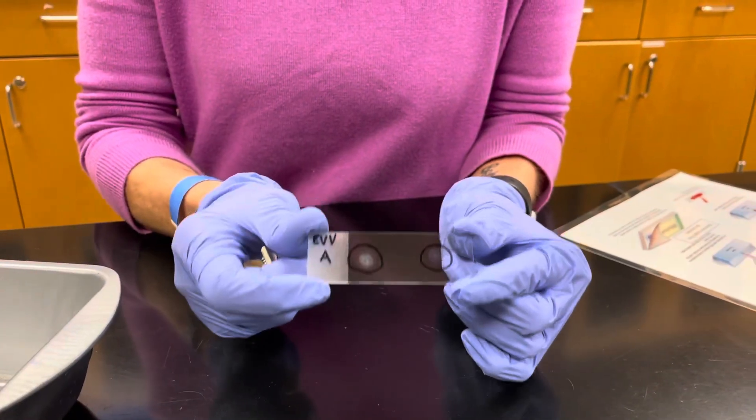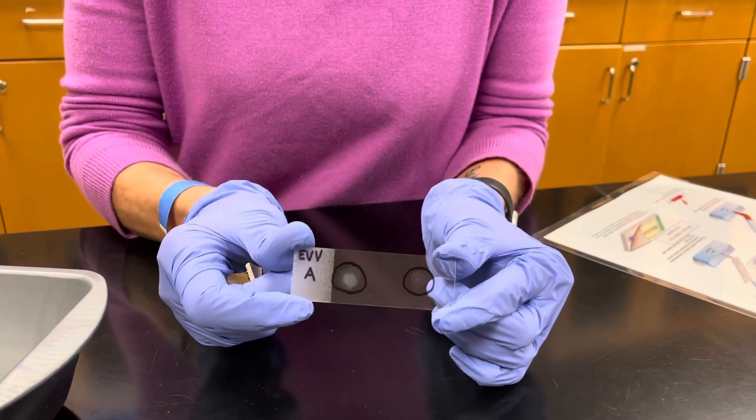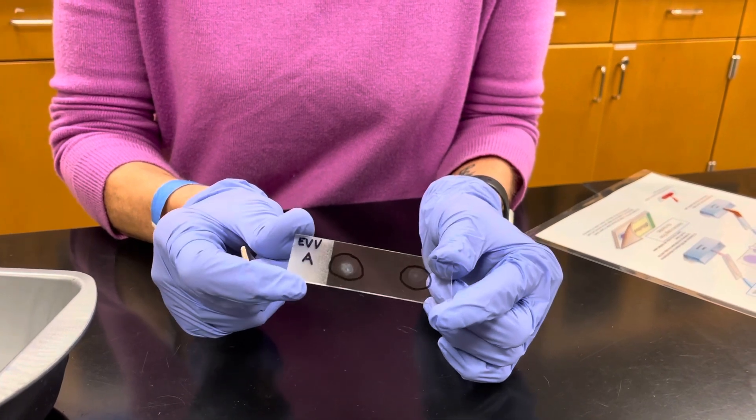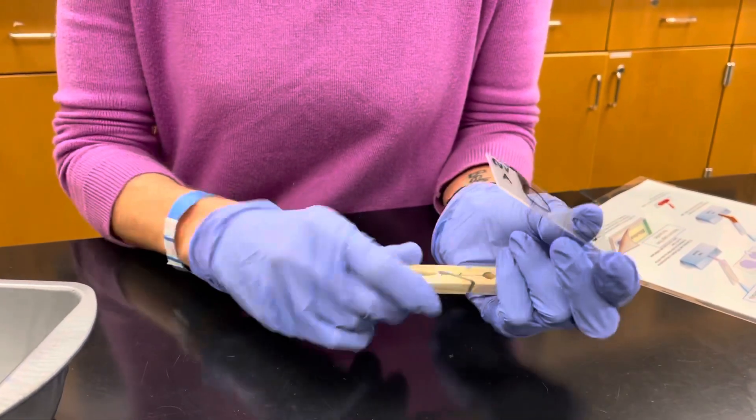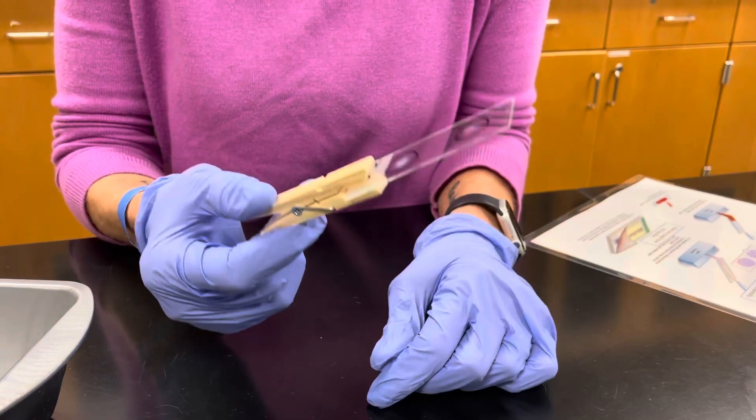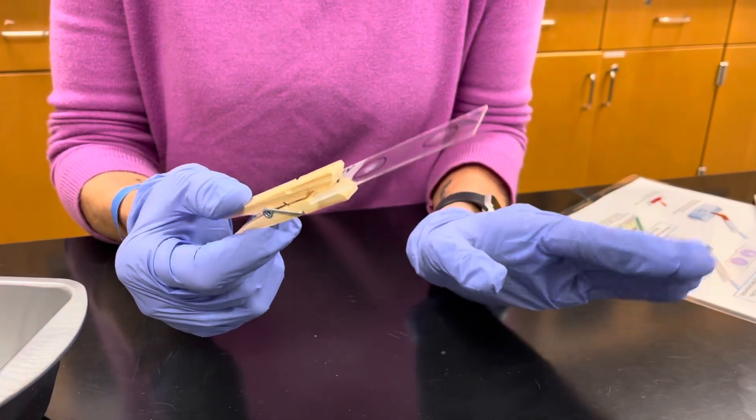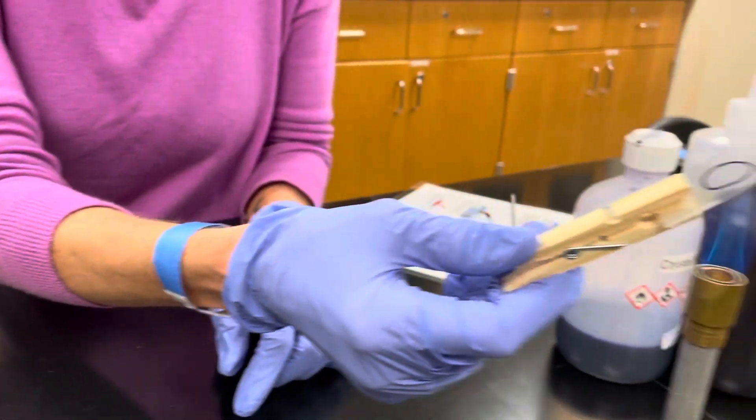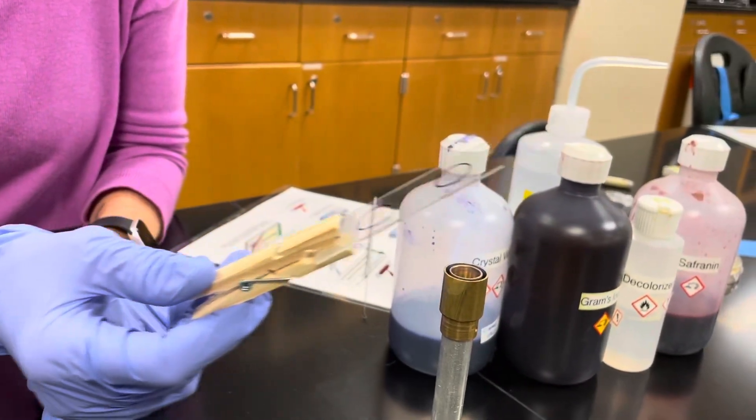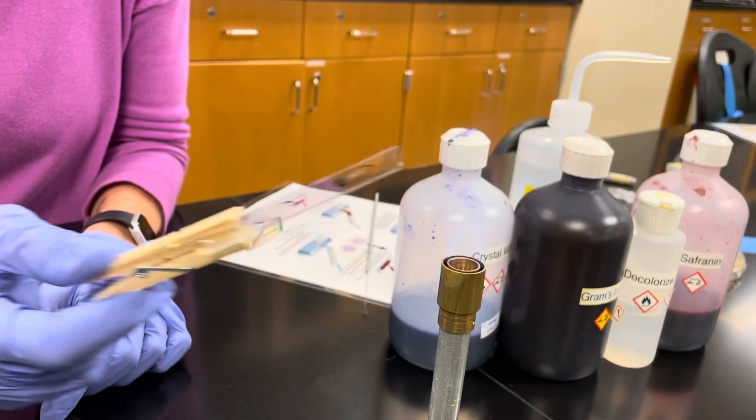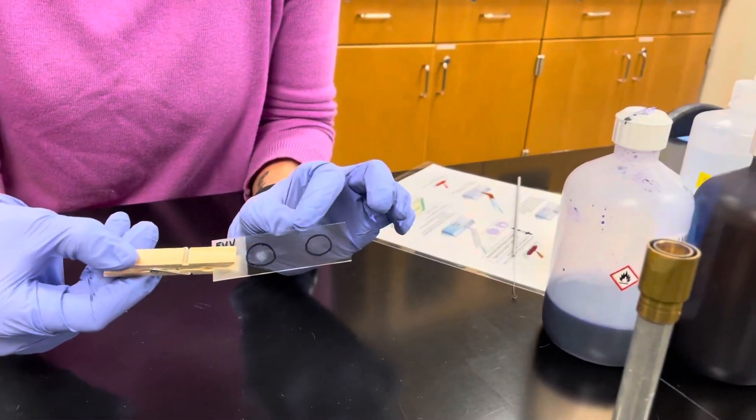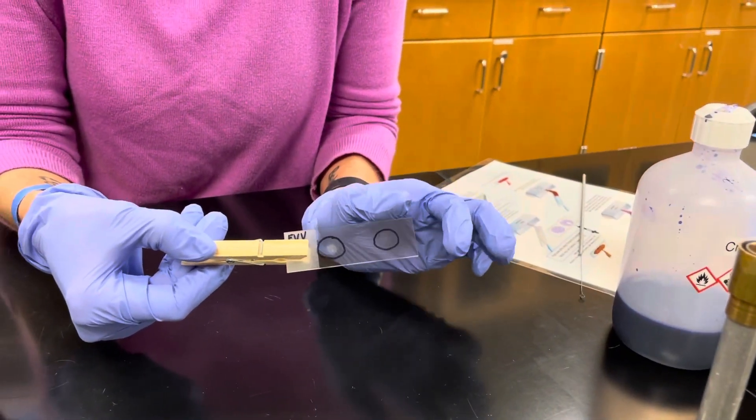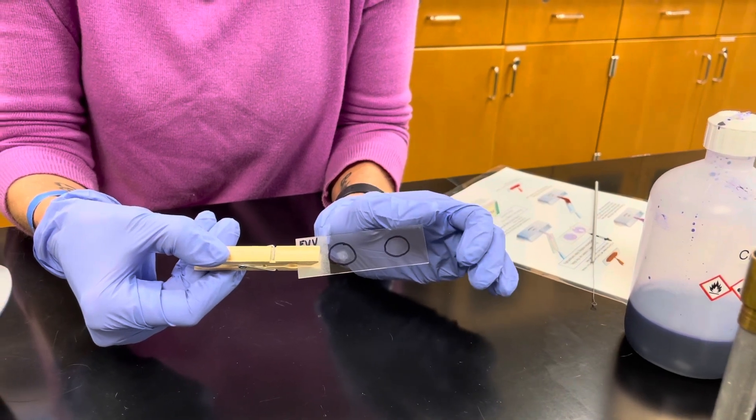Once your slide has air dried, notice there's just a slight film on them. They're not super thick. Go ahead and take your clothespin and we have to heat fix this. You do this just by passing it through the flame three times. One, two, three. Remember, this is to heat up the slide to coagulate the proteins so our smear won't come off the glass slide while we're staining.